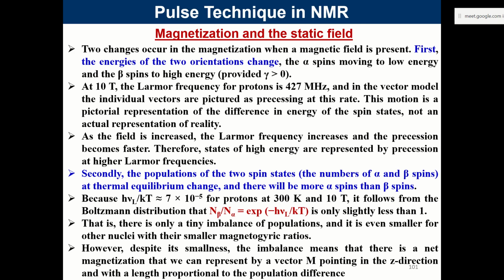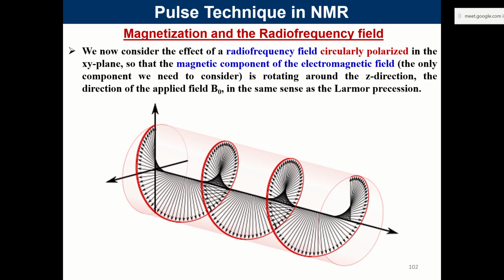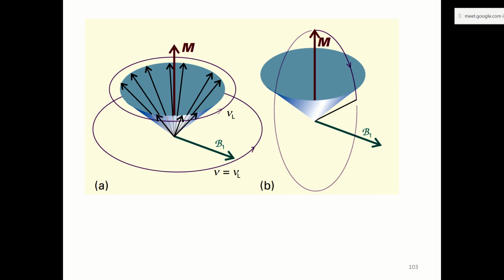Learning this thing will help you. So this is the picture of what we visualize as a circularly polarized electromagnetic wave. This is the direction of propagation, z, and this is the xy plane circle. You can see that the magnetic field vector is contained in the xy plane. It is moving in a circle in the xy plane, perpendicular to the direction of propagation of the light.